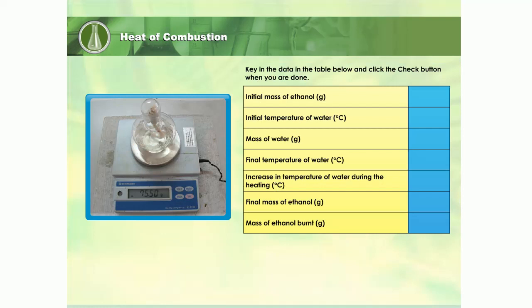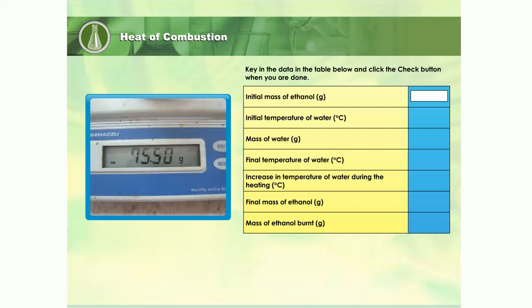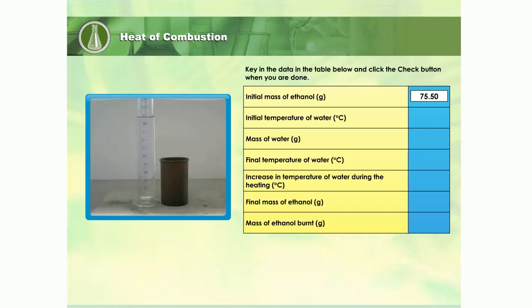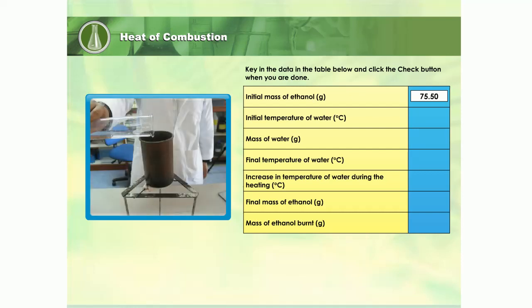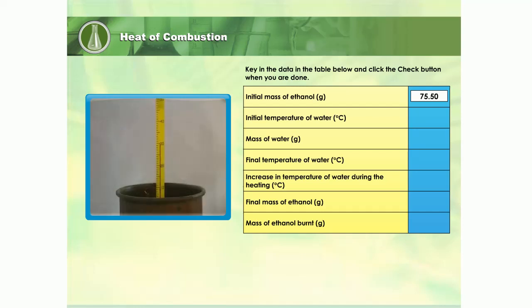The burner containing ethanol is weighed on the digital electronic balance. Record its mass in the table provided. A copper can filled with 200 cubic centimeters of water is placed on the clay pipe triangle. A thermometer is then placed in the water. Record the initial temperature of the water and the mass of water in the table.